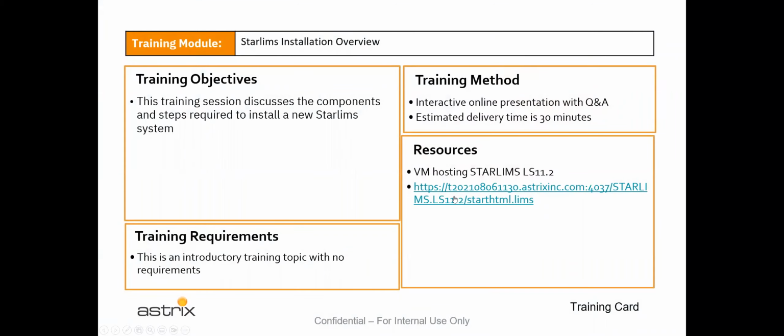It's an introductory training topic with no requirements. And I want to make sure I'm still recording here. Or did I stop it? Oh, it's been recording this whole time. Okay, so I'll edit the silence out when I'm done.